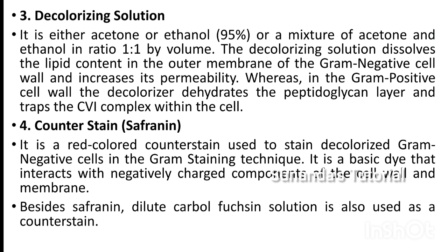Okay, next, the decolorizing solution. It is either acetone or ethanol. Okay, next we will use the counter stain, which is safranin. Okay, and it is a red colored counter stain. So the decolorizer dissolves the lipid content which is present in the outer membrane of the gram negative bacterial cell wall, and increases its permeability.